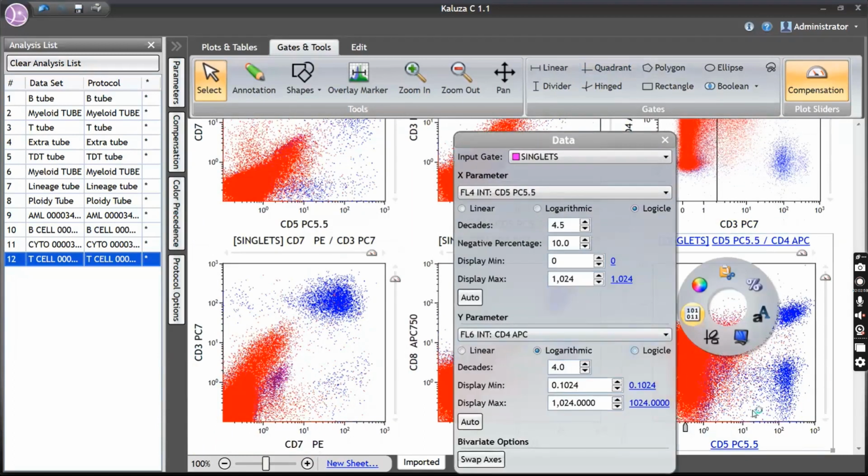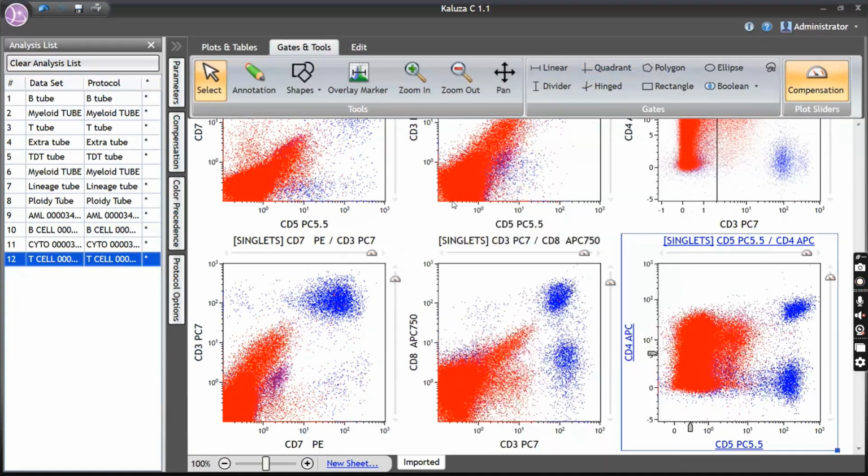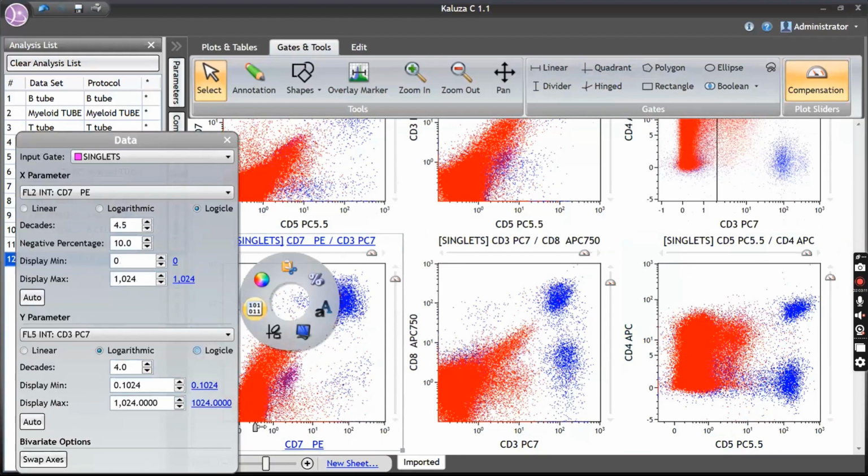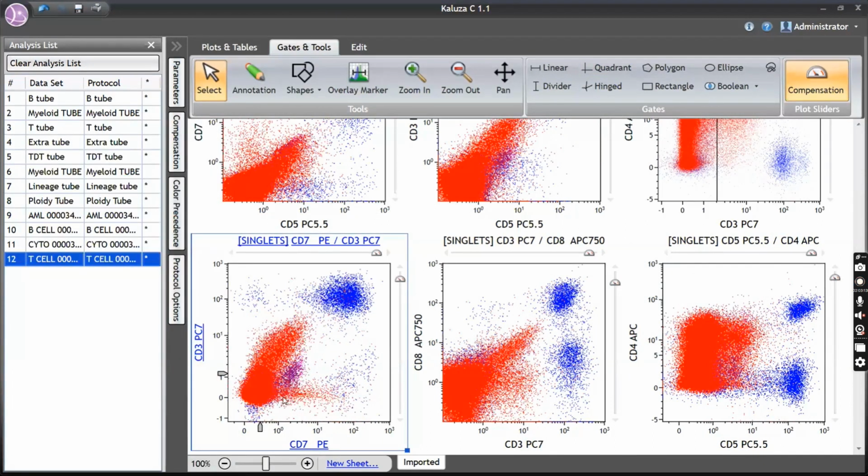So this case was given by Dr. Shaini. She said she will join a bit late today, but is she there? I don't think so. So this is a case given by her. Really a good case, really a challenging case. But anyhow, I would sign this as B-ALL with aberrant myeloid markers, CD13, CD33 and subset CD117. Definitely ask for cytogenetics, BCR-ABL.